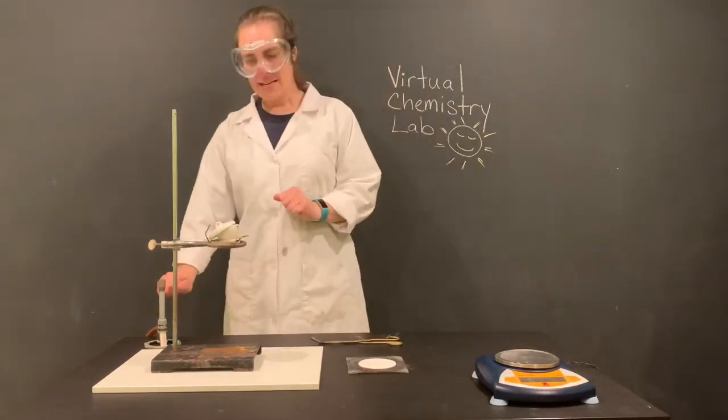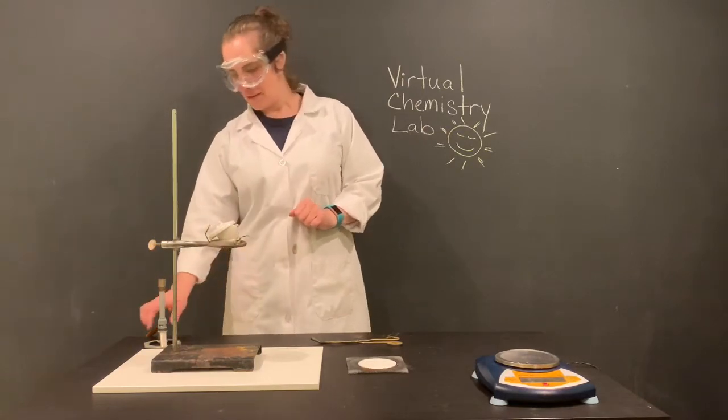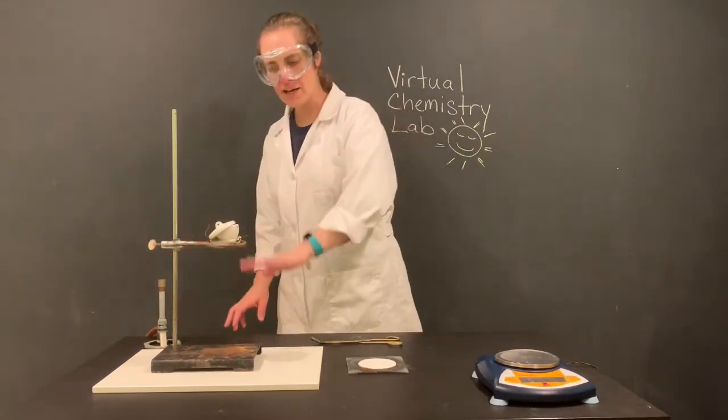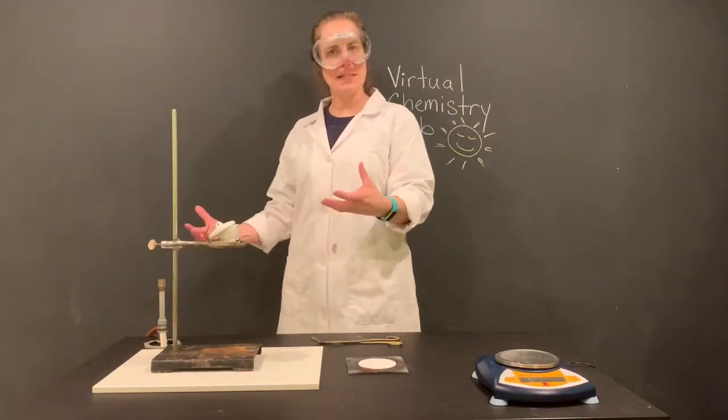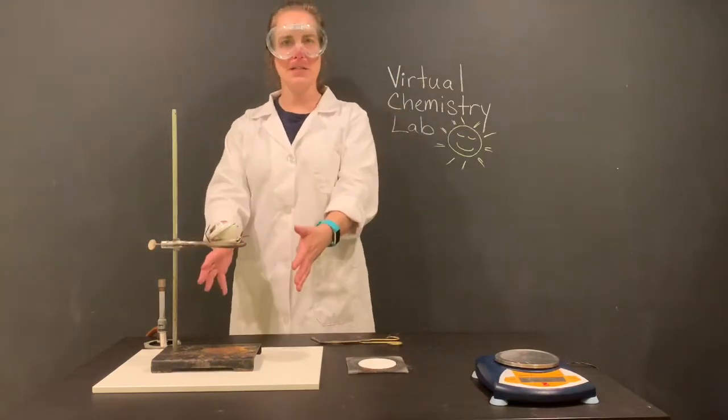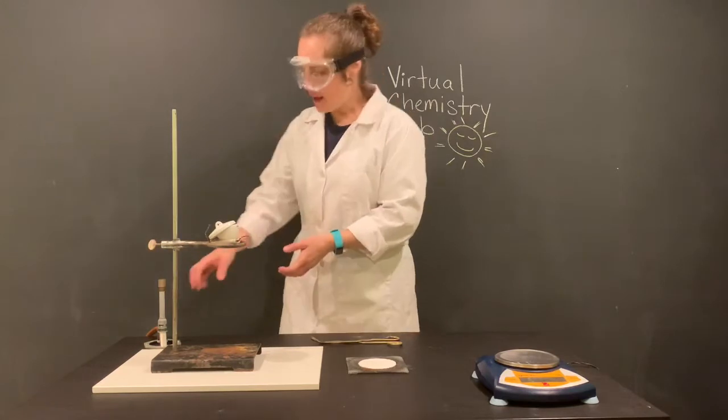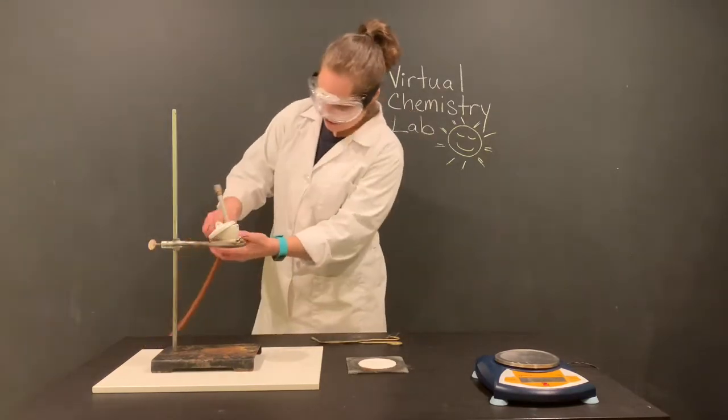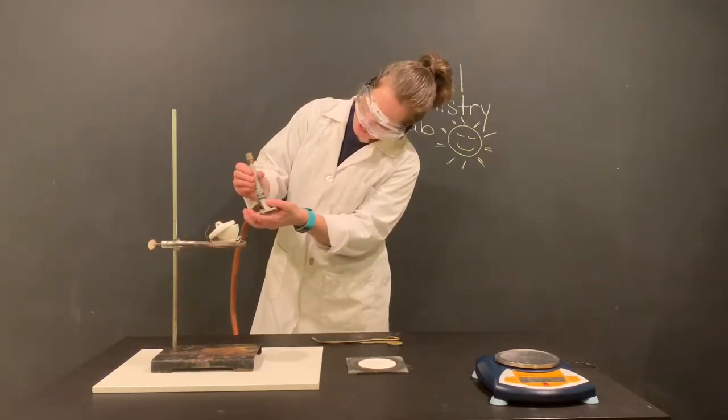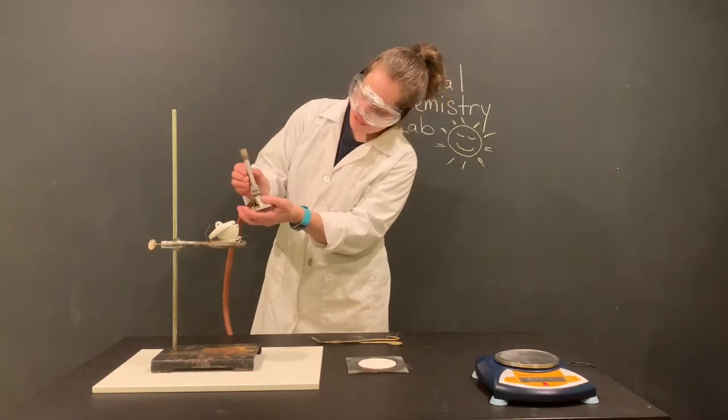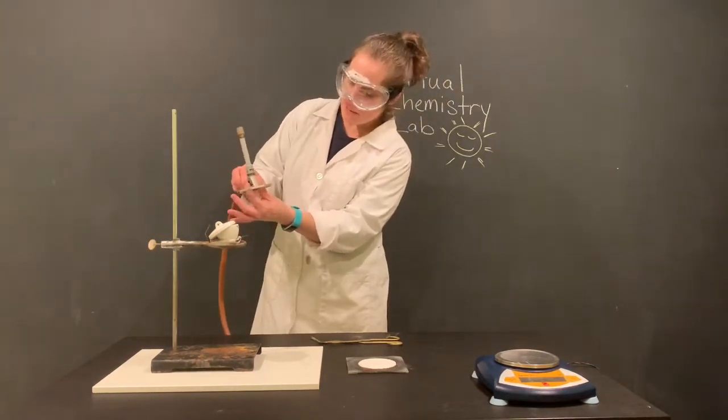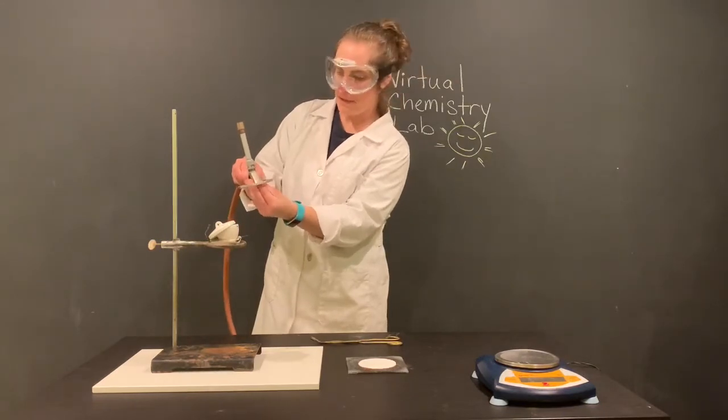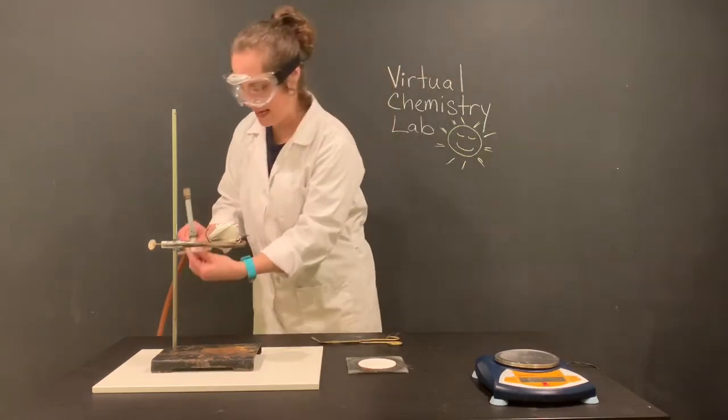Now next thing we want to do is light this Bunsen burner. You notice we're not going to light it underneath here, because we want to be able to get the flame the way we want it before it encounters our experiment. So I'm going to make sure I'm turning my little shaft here to make sure I have good oxygen, plenty of oxygen coming in, but I don't want too much. I'm also going to make sure the nozzle is open so that I'm getting plenty of gas.